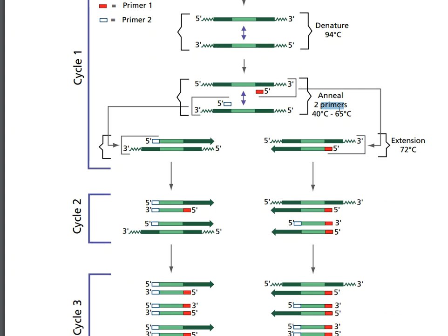And then what will happen is that we'll warm this up to 72 degrees, so a little bit warmer than the primer attachment. And then that is when the Taq polymerase and the reaction begins to extend the DNA strand. So what you'll see is that here we get the primer. That primer recognizes the DNA strand that we're interested in. And then from that moment, it begins to copy the DNA strand using those base pairs that we have put into the mixture. The same thing happens on the other strand of DNA, because remember, you've got 2.